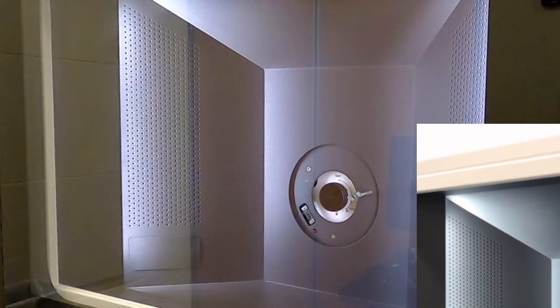It looks like my camera is still not working, but I am waiting for the pumping cycle. Okay, so the pumping cycle is done, and you will just have to turn it counterclockwise and insert it. Again, if you want, you can go back to the very beginning of this video to see that procedure again.